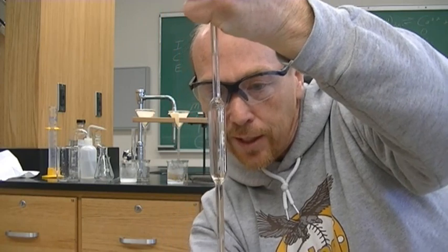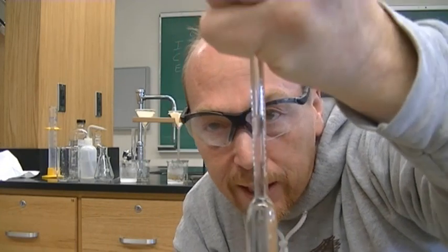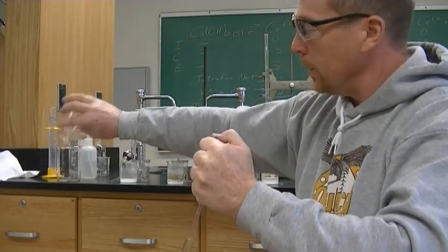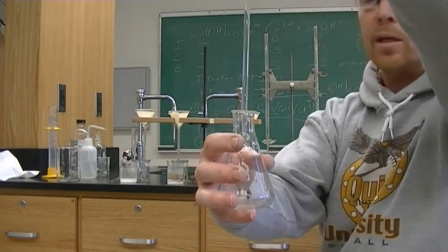All right, I did it. Okay, so now it is right on the meniscus. It is a perfect 10 milliliters. And so I rinsed out my flask. Again, it can be wet with deionized water. All right, and then you deliver it, which means you let go and it will go in. Gravity takes it in, and when you are done at the bottom, you will tap off on the sides.